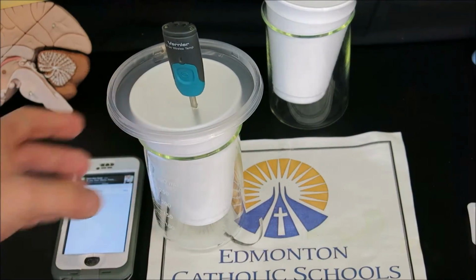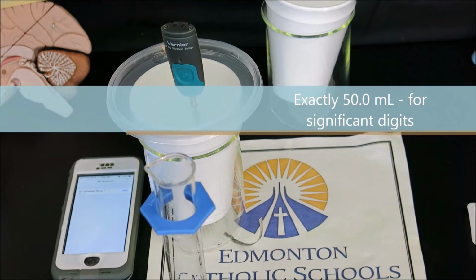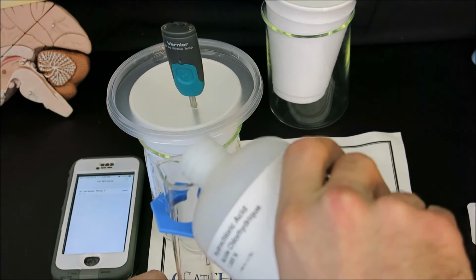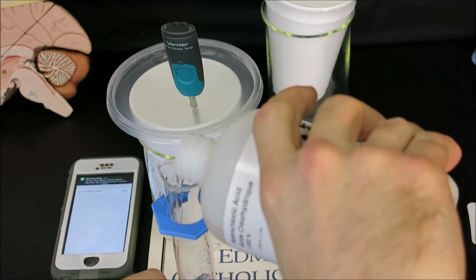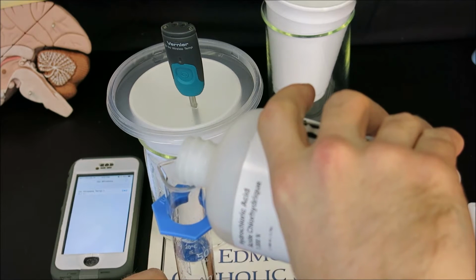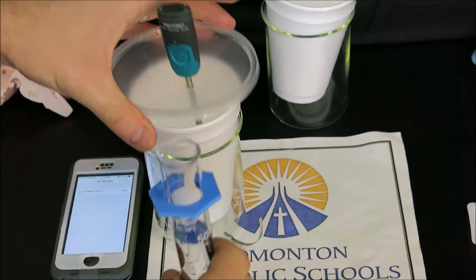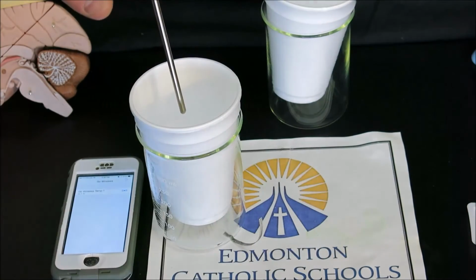At this point, we're going to take our calorimeter and put 50 milliliters of 1 mole per liter hydrochloric acid into the calorimeter. This hydrochloric acid will react with magnesium, and the resulting solution of magnesium chloride can be assumed to have the same specific heat capacity as water, as one of our calorimetry assumptions is that aqueous solutions can be calculated with the specific heat and density of water. So we'll place in our 50 mL of hydrochloric acid.